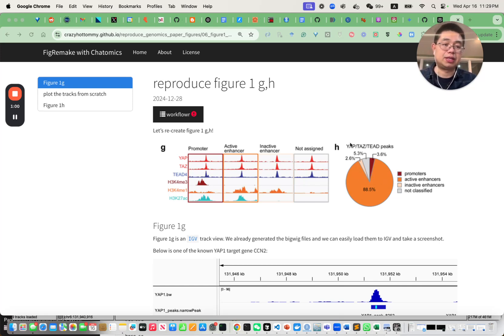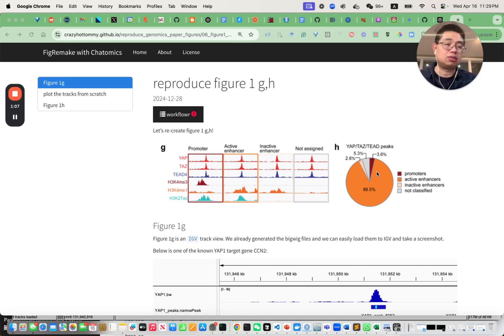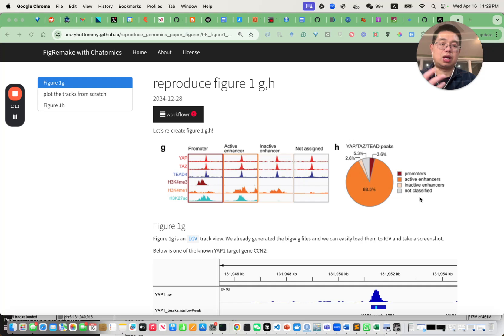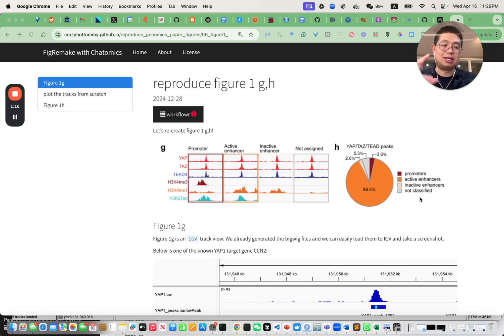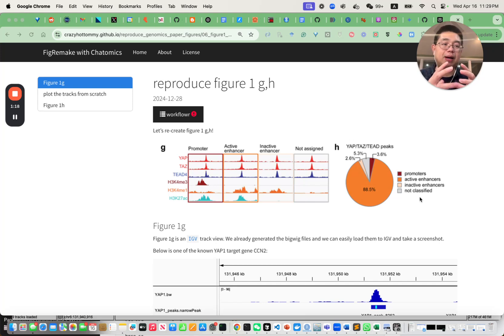For the peaks that are common among those three transcription factors — YAP, TAZ, and TEAD4 — you annotate them: whether they are promoters, whether they're active enhancers, inactive enhancers, or not classified. Once you get the numbers, you can easily make a pie chart.